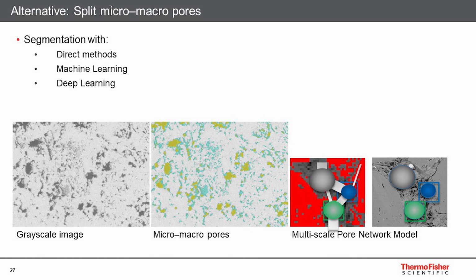This work is being conducted by our experts, and we will soon be communicating more about this topic. Note that segmentation by machine learning and deep learning is already available in PerGeos software.